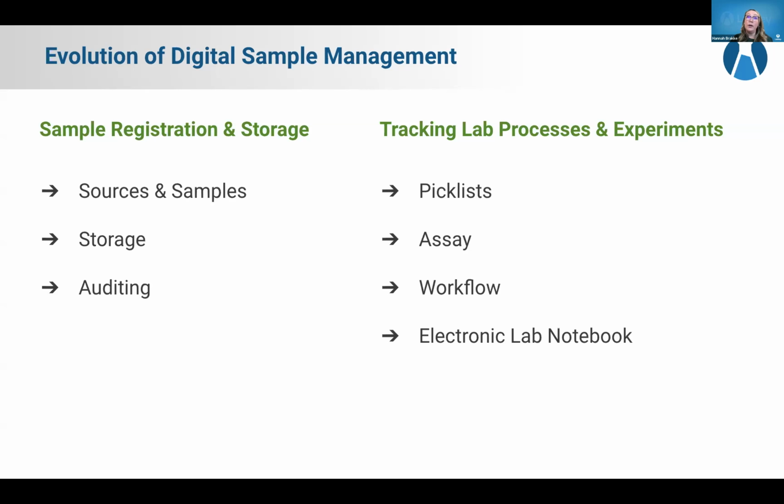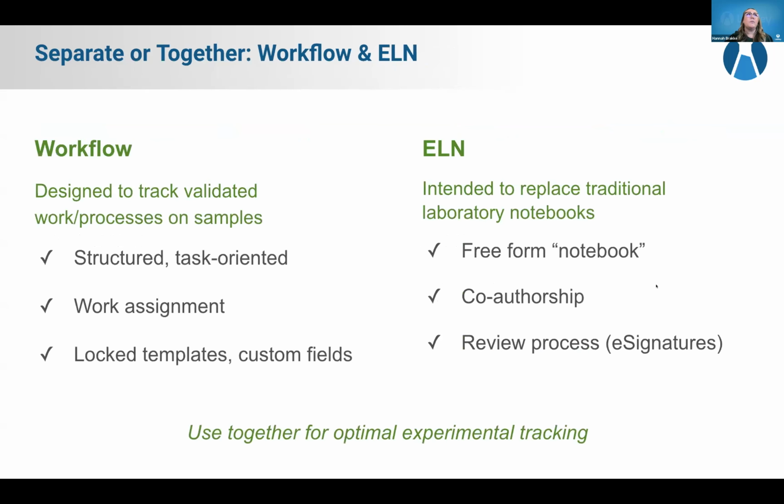But I really want to focus on workflow and our electronic lab notebook today, because this is the piece where a lot of folks come to us asking, why should I use workflow or why should I use ELN? What are the differences between these? So I'll share why we designed these two features to begin with.